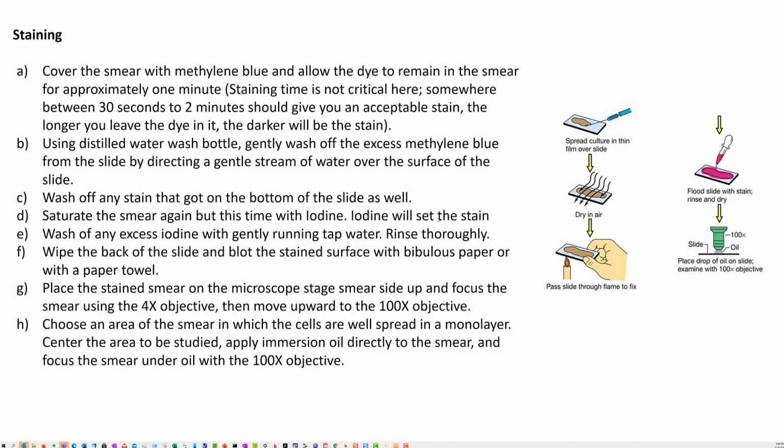So when you do the staining, you cover the smear with whatever dye you have, and usually you wait about 30 seconds, or I usually, on average, about a minute or so. What you'll notice is that the smear will take on a little bit of a darker color, and you can rinse. Don't wash or jet spray, or start up the water to spray off the bacteria. The reason is that you want to keep your sample on there, so make sure the water flow is really just dripping on there.